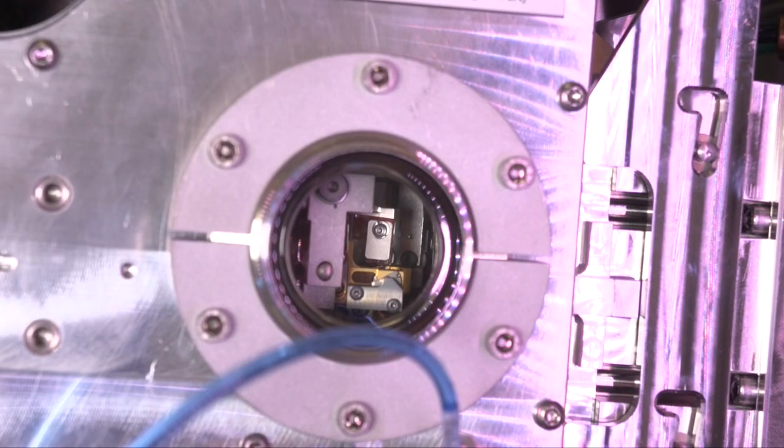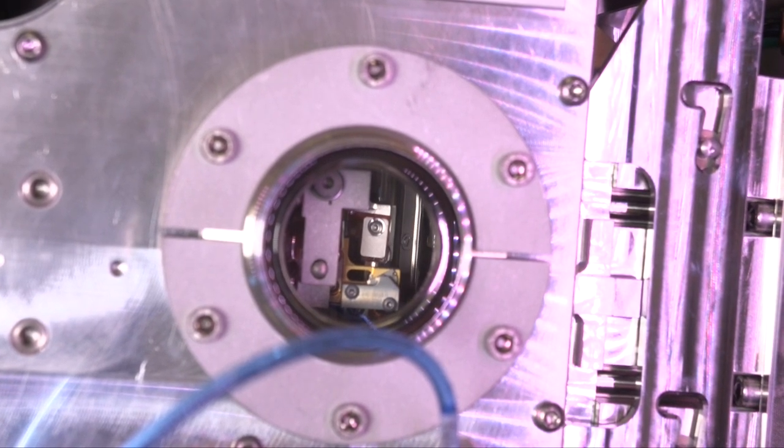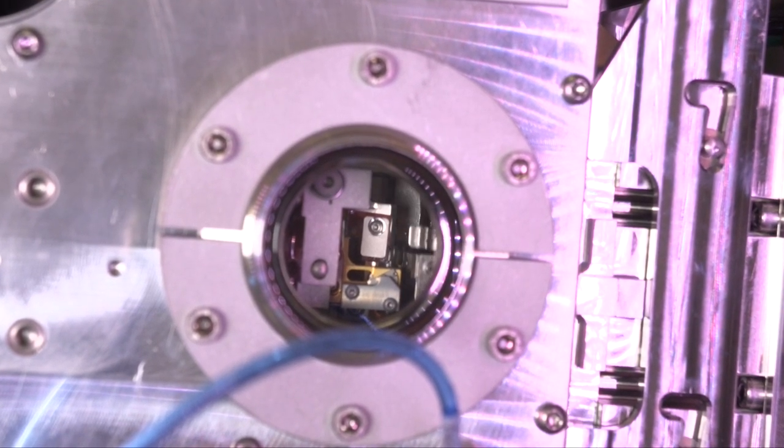Cryo-EM may turn out to be one of the best investments NIEHS has made. The potential of cryo-electron microscopy is becoming more evident every day, with three of the scientists who developed the technology sharing the 2017 Nobel Prize in Chemistry.